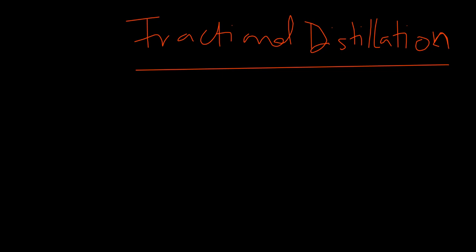But the concept follows the same concept of evaporation and condensation. Those two processes are the processes involved in fractional distillation. You evaporate the liquid, then you capture it by condensing it into the same liquid. That's how it works. So how does it work here?